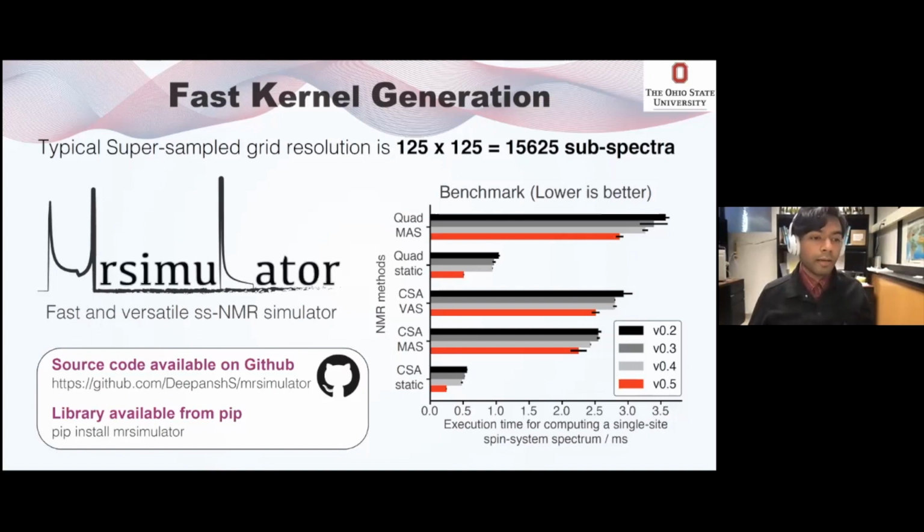And two, if there is more than one spike, then they have to be smoothed out. Again, this is based on what the literature believes is the right way of choosing a probability distribution, but it's in no respect a unique solution.